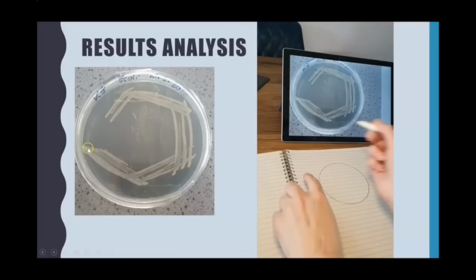The whole point of streak plate is you only dip it into the bacteria once, the inoculating loop, and you're spreading it, and then you can clearly see I've then dragged across the first spread, dragged across the third, 4th, and I've even gone for a 5th, and each time you're spreading the bacteria thinner and thinner, so eventually you are able to identify these individual colonies.